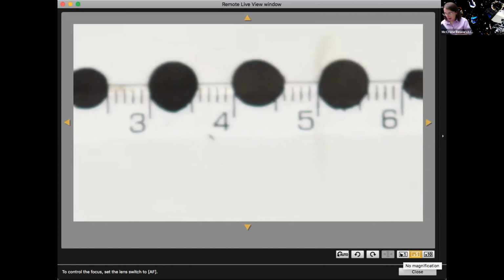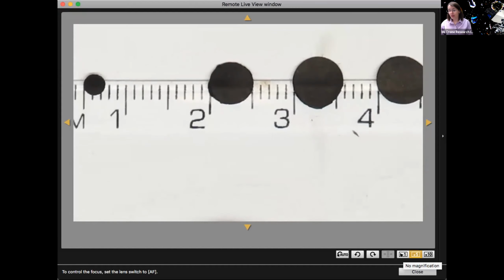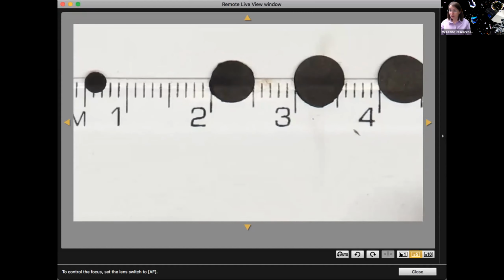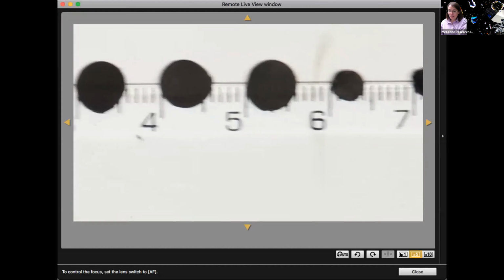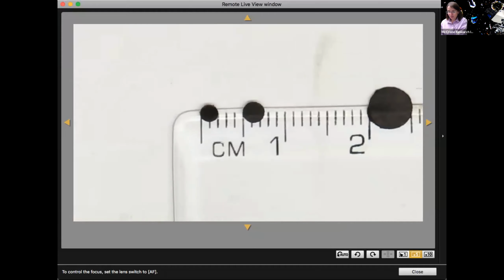Okay, so I made these in a bunch of different sizes. The diameter, I wouldn't necessarily say my favorite. I would say the one that has been the most useful in the ones that I have installed it in has usually been about a 3 to 4 millimeter spot size. So if this one were a little bit nicer shaped, this would probably be my first choice. Sometimes something smaller can work better. These are really small. Here's about a 2.5 or a 2 millimeter diameter. Those may work as well.